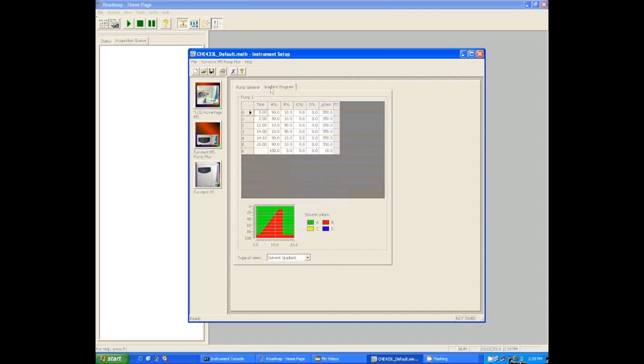Now we're going to turn the mass spectrometer off. We're going to turn the detector off at 14 minutes because there's no point in the detector watching this stage where we're re-equilibrating. It's not analytical data. It's just to prepare for the next run.